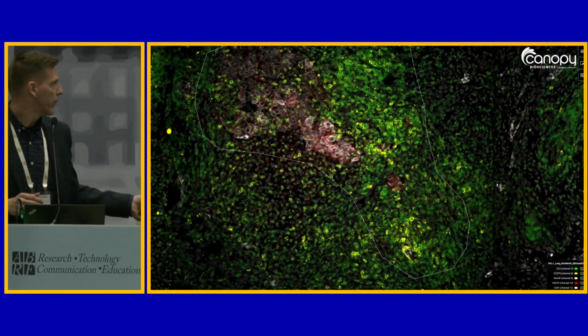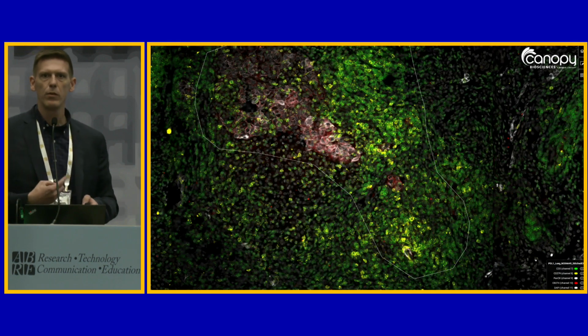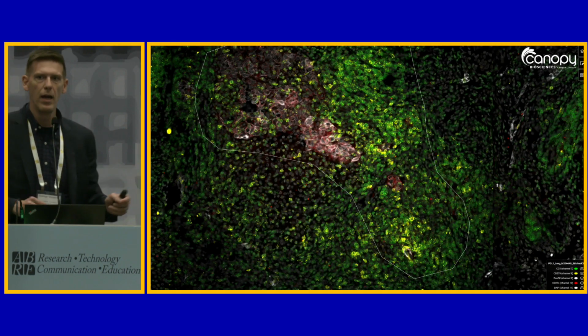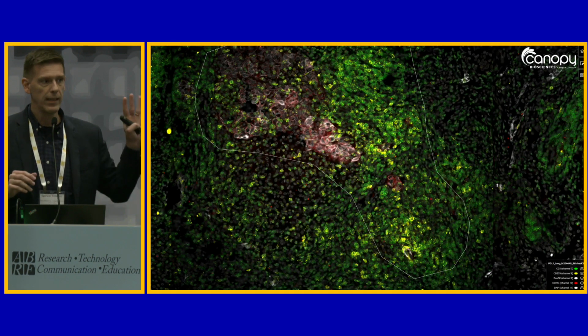Final example here. I'll get out of your hair. So this is a true example where you might actually need HDR. Here we're looking at PD-1, PD-L1 on cancer versus essentially T cells attacking cancer cells again. What you'll notice is this blazing bright PD-1 and also some fairly high PD-L1.